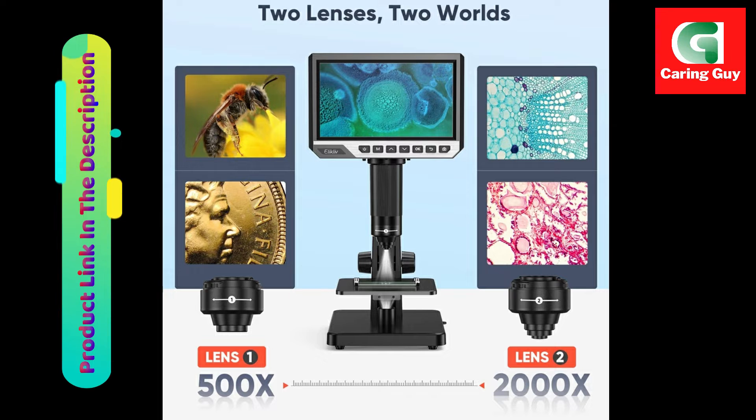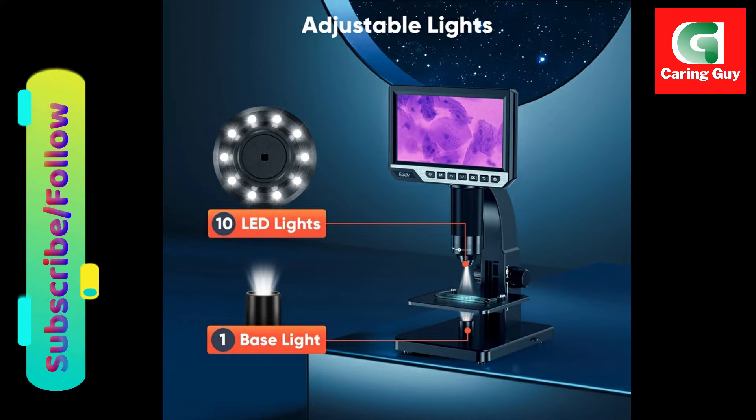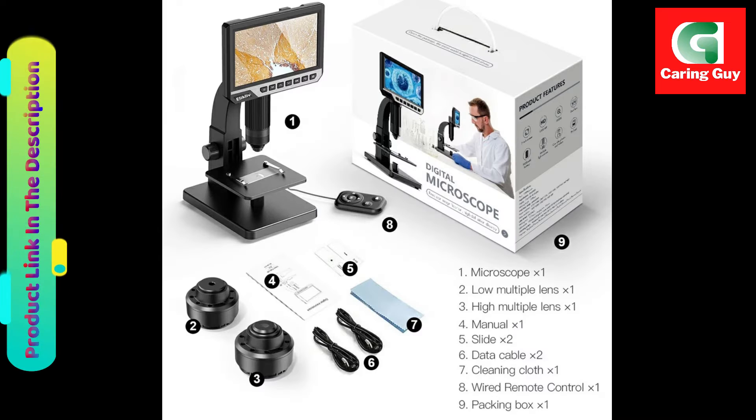The inclusion of a remote control adds a layer of convenience to the user experience. The remote control eliminates the issue of screen shaking after capturing photos and videos, making the workflow smoother and more efficient.